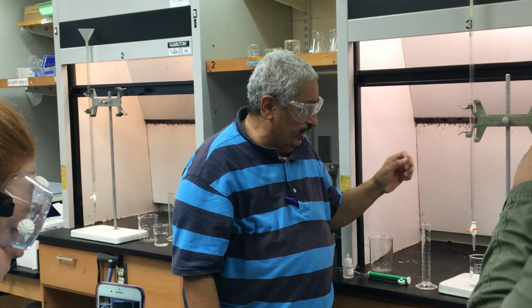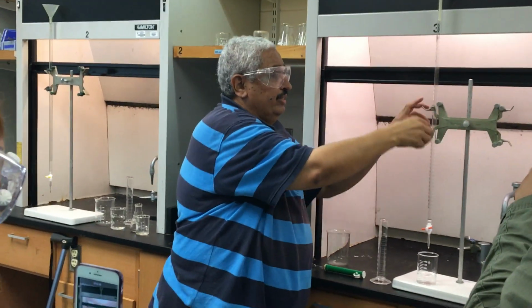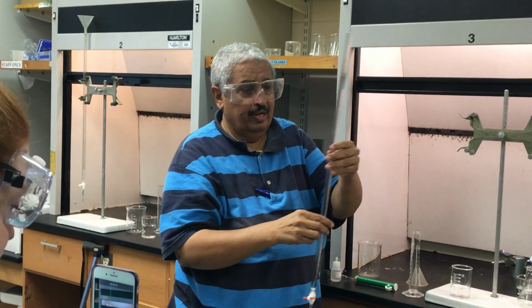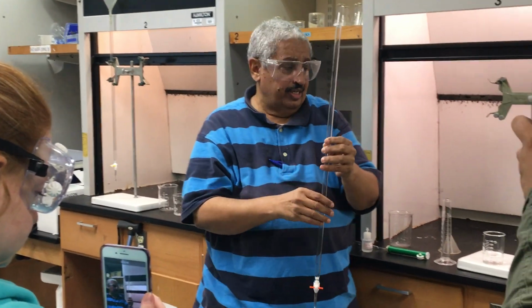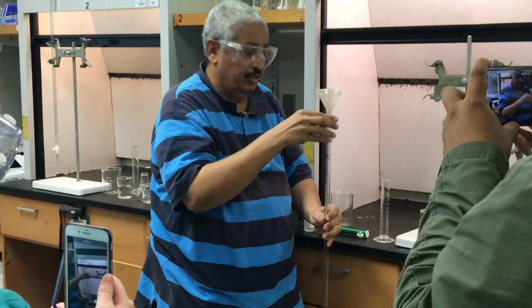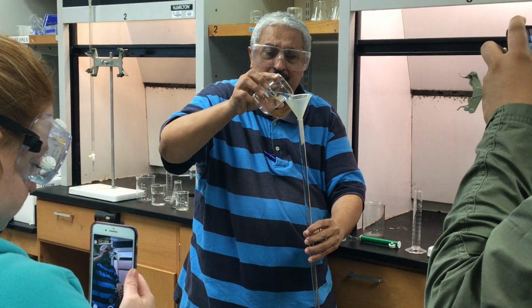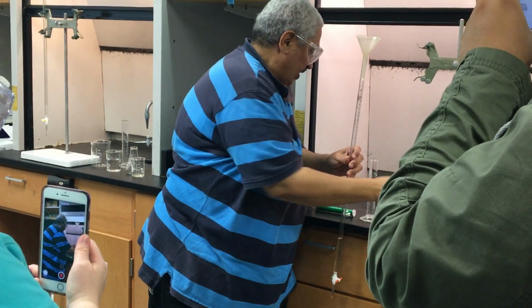The first thing I have to do is clean up my burette, which I call conditioning. The burette may have impurities, and we don't know what's inside. So it is better to condition it with the same sodium hydroxide I will be using. The inner walls of the burette will be covered with fresh sodium hydroxide, maybe a couple milliliters, not that much. Then I will have my waste.